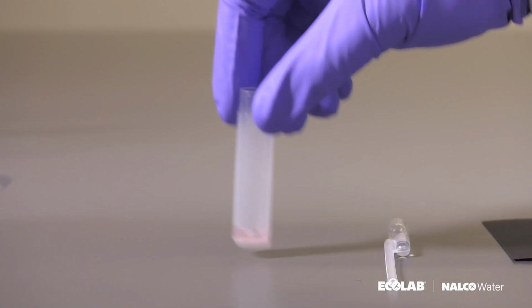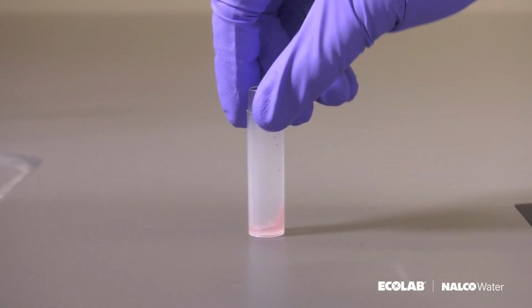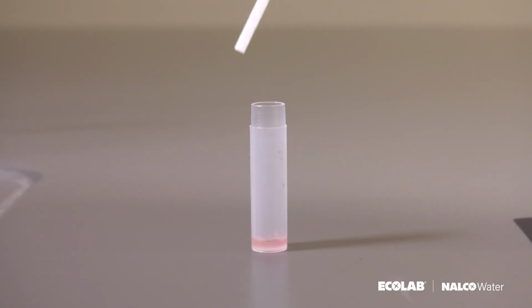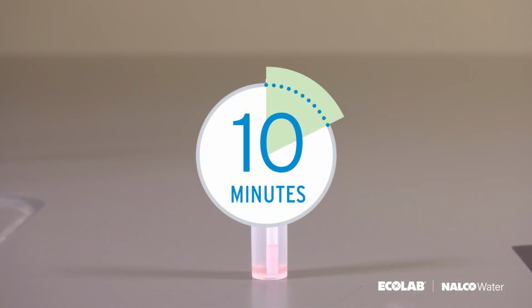Lightly tap the vial and swirl to mix. Wait 5 minutes, then lightly tap the vial and swirl to mix again. Insert the test strip into the vial with the blue side pointing up. Leave the test strip in the vial for 10 minutes.